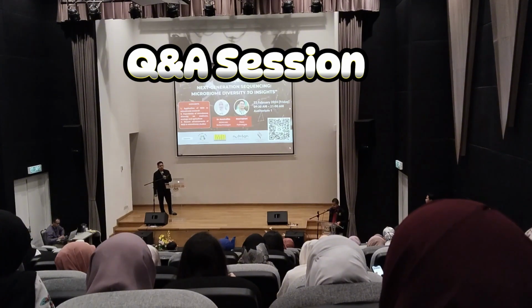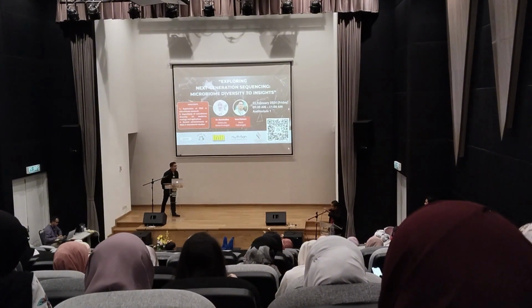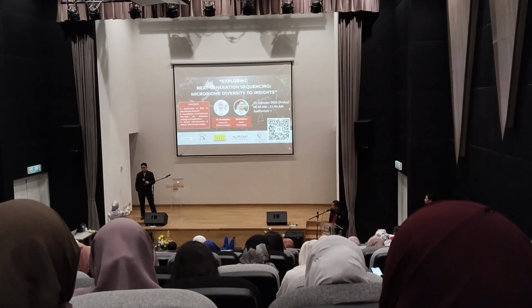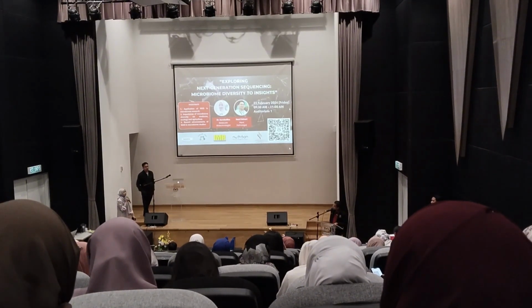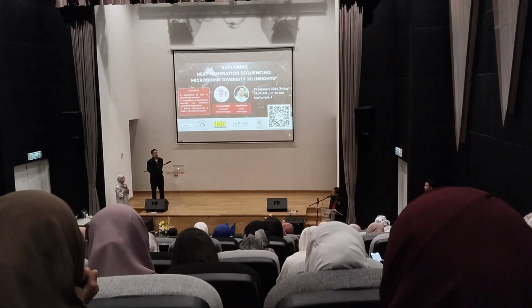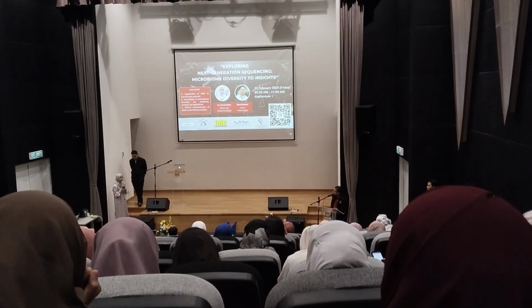I'm just wondering, when they prepare the biofertilizers, is it consistent, like the microbiota will be consistent between this preparation and the second or third preparation? Do you guys have any answer to that? So actually, I think that is for the quality control of the products, in case they are manufacturing their own biofertilizers, which can also be carried out by us.